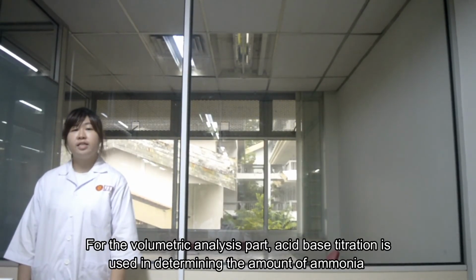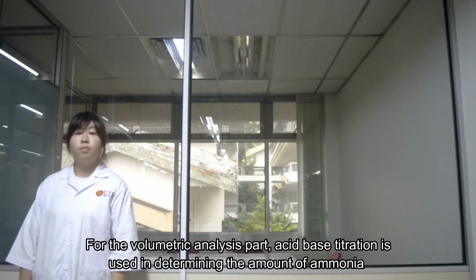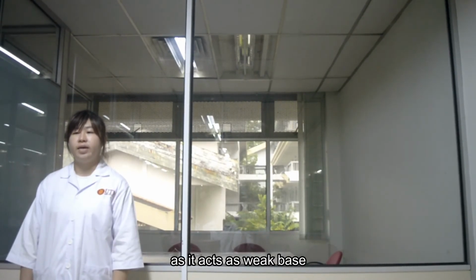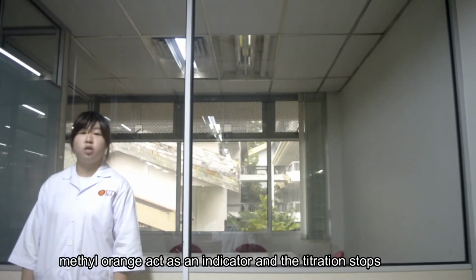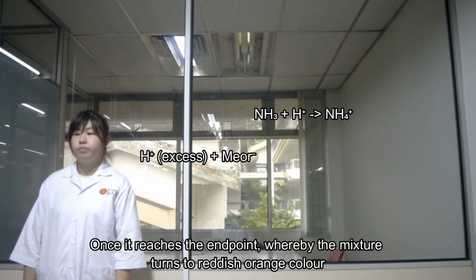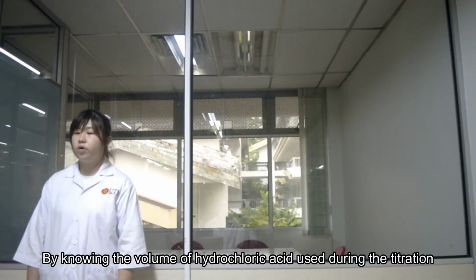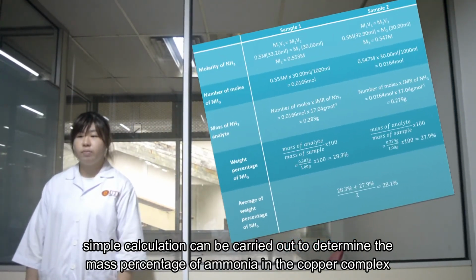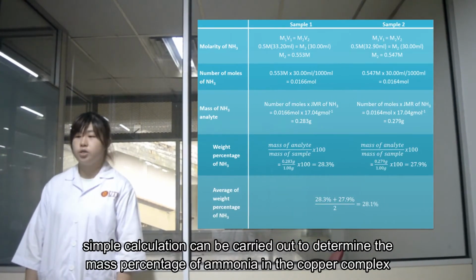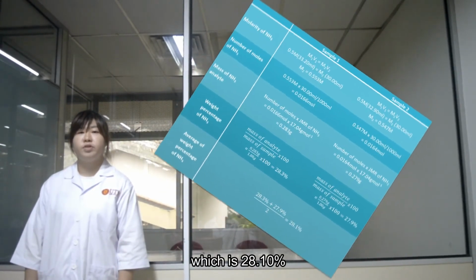For the volumetric analysis part, acid-base titration is used in determining the amount of ammonia as it acts as a weak base. Methyl orange acts as an indicator, and the titration is stopped once it reaches the endpoint, whereby the mixture turns reddish-orange. By knowing the volume of hydrochloric acid used during titration, simple calculation can be carried out to determine the mass percentage of ammonia in the copper complex, which is 28.10%.